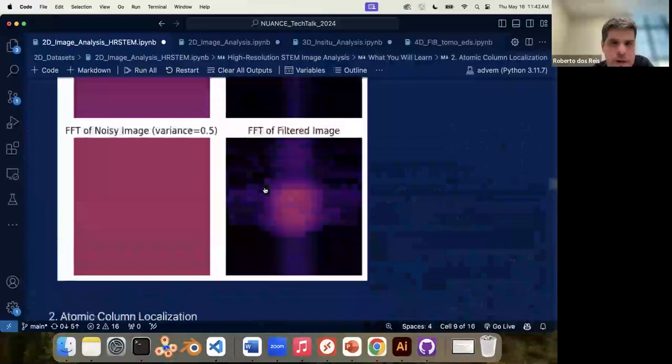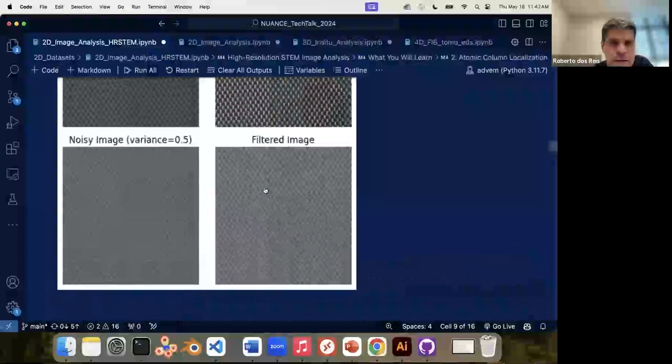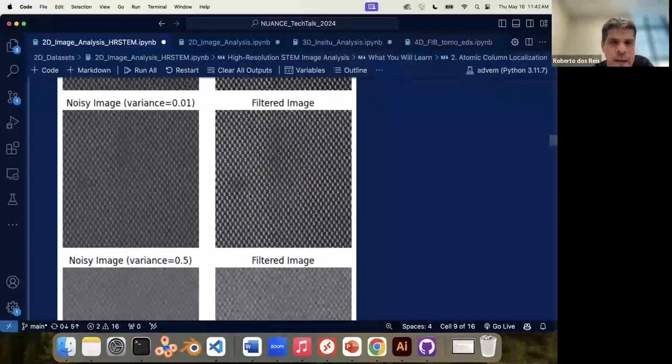So if you go back to the high res image, you do have some dips in the intensity here, and then you do have something in the background, right? So you might want to distinguish that background and create a threshold for that. So when you run the peak finder, that will not determine this region here as a peak. That is one strategy.